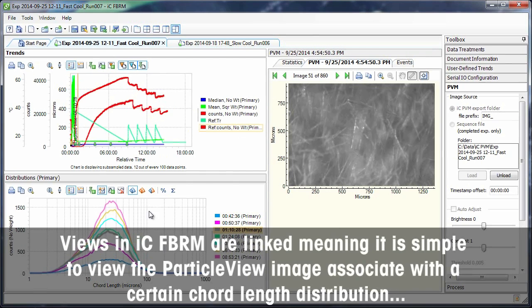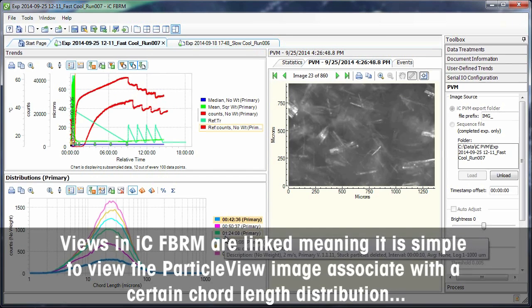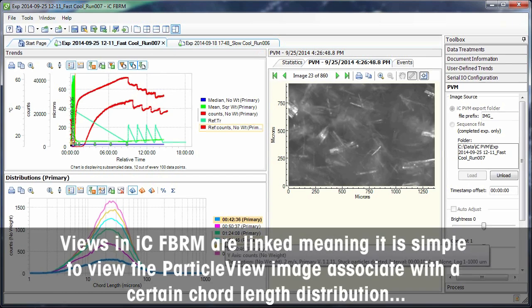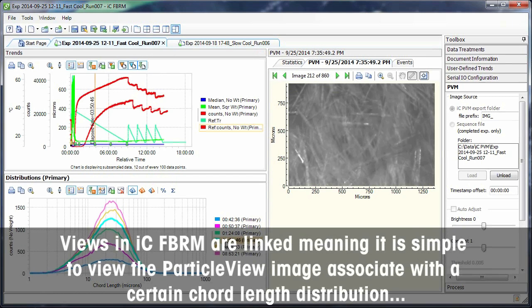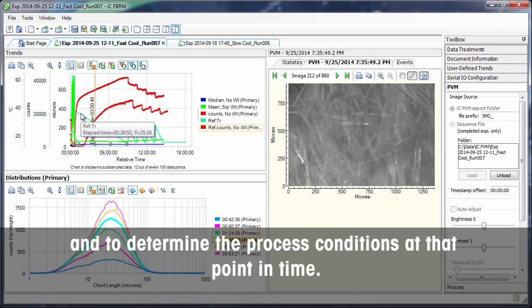Views in ICF-BRM are linked, meaning it is simple to view the particle view image associated with a certain chord length distribution and to determine the process conditions at that point in time.